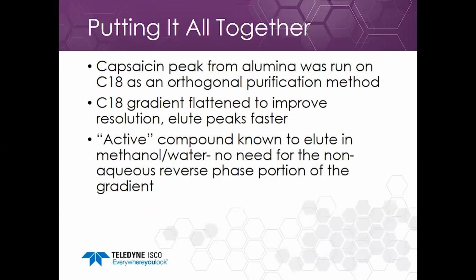On the screening run, I ran from about 5 to 100% methanol. I don't need to run the beginning part of that gradient because all I have are the capsaicins. So I can flatten out that gradient and elute the peaks a little faster. Also, because the compound eluted in methanol water, there was no need to run the non-aqueous reverse phase portion of the gradient. I didn't need to run the dichloromethane portion.